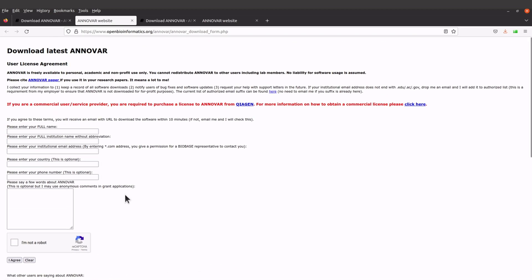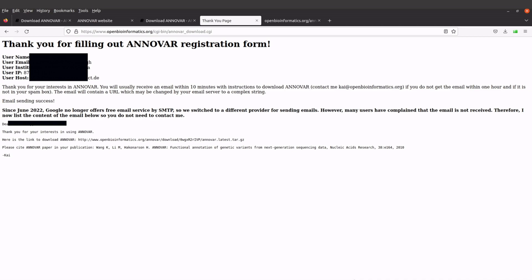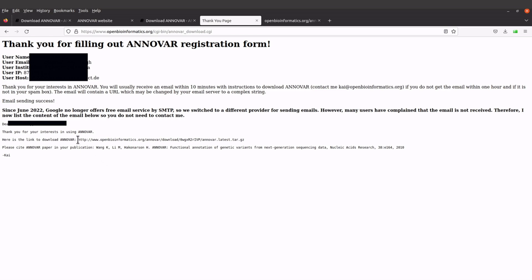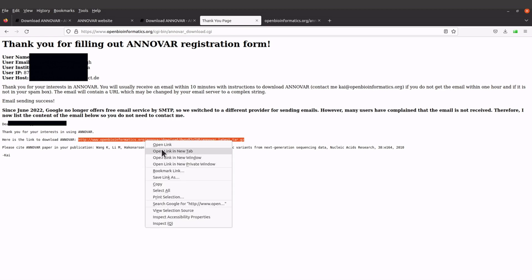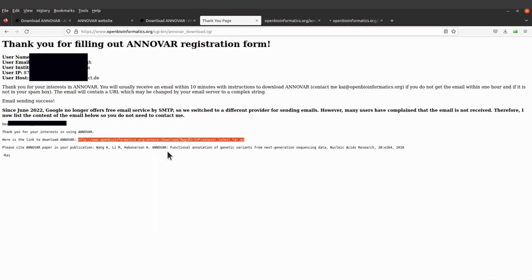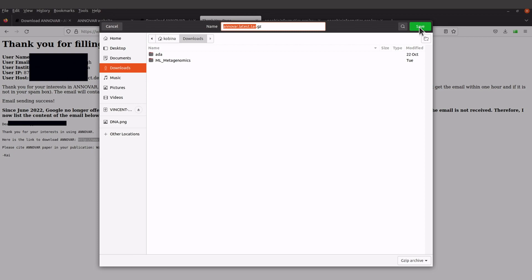After filling and submitting the form, you get an email that contains the link to the ANOVA software. As of the time of making this tutorial, some things have changed, so in addition to the email I also had the download link displayed for me on the page. Once I have this link I can use it to get the software — you can use your browser to open the link and save the software.